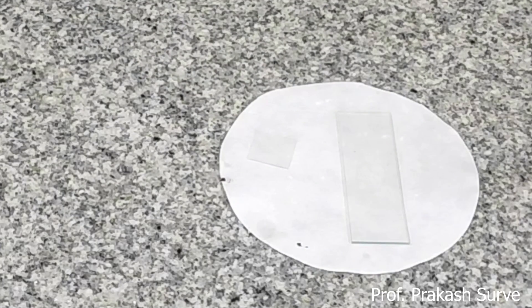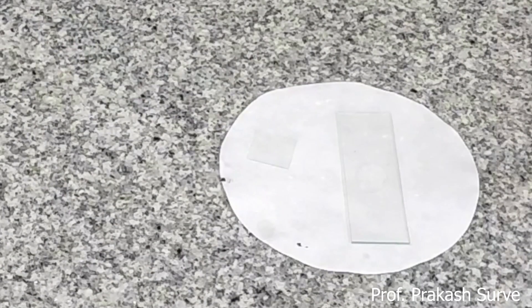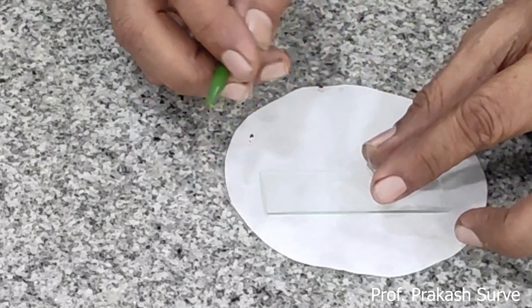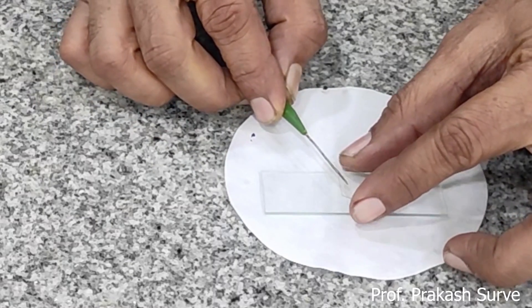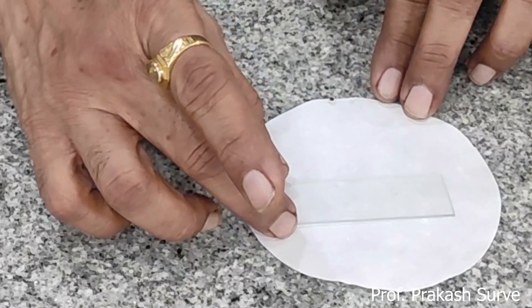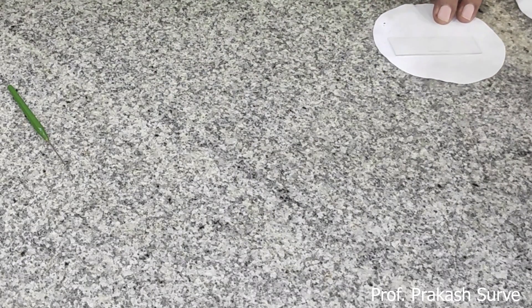If required, add one more drop of the sugar solution. If glycerin is required, add it as well. Then put the cover slip carefully on the slide — just touch one side of the sugar solution and release with the help of the needle so that there will not be any air bubble. The slide is now ready.